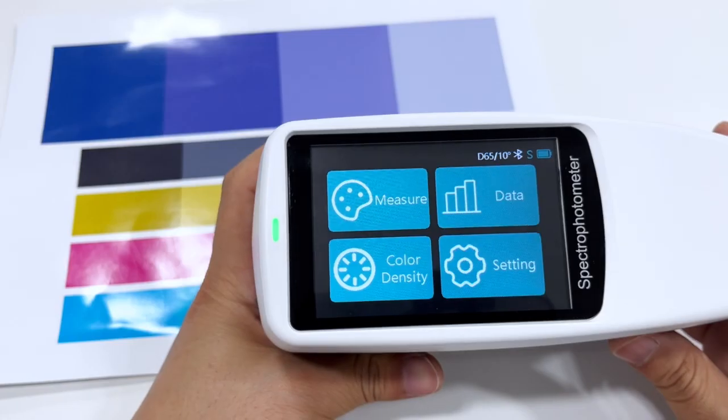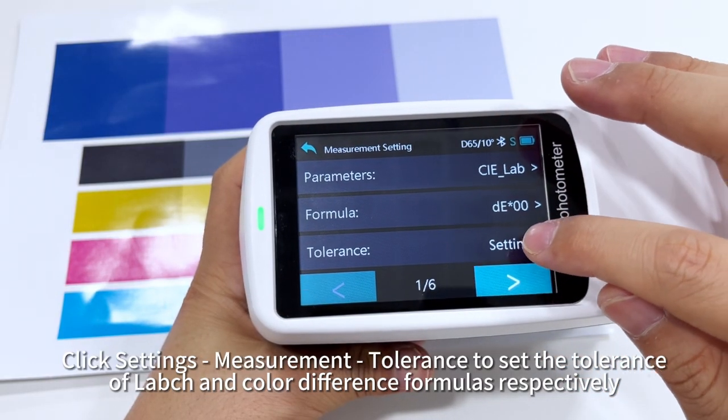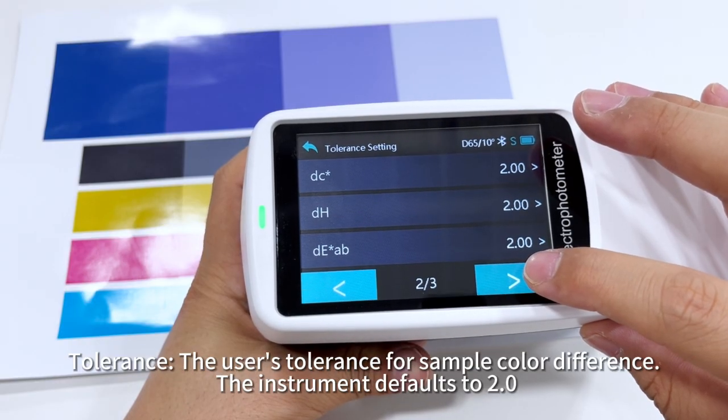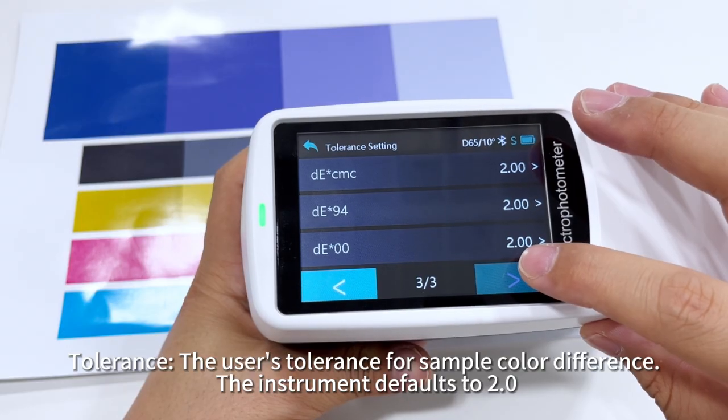Tolerance settings. Click Settings, Measurement, Tolerance to set the tolerance of LABCH and color difference formulas respectively. Tolerance is the user's tolerance for sample color difference. The instrument defaults to 2.0.